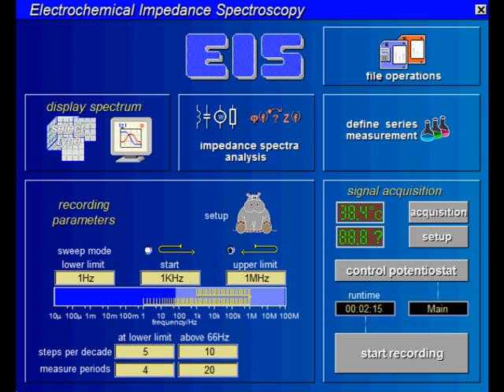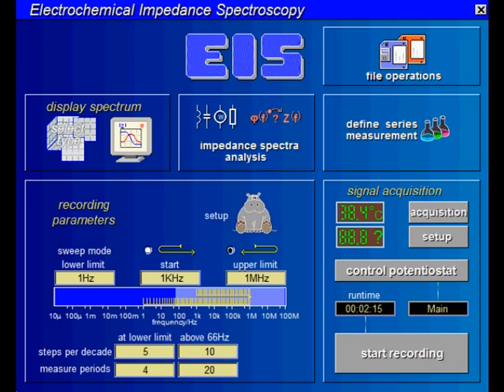Additionally, you can set the starting frequency, which can be any frequency within the range you set before. We recommend keeping the sweep mode as it is. In this case, the frequency sweep starts at the starting frequency, goes up to the upper frequency limit, and then back to the lower frequency limit. The range between the starting frequency and upper frequency is measured twice, allowing you to check the stability of your probe — it is stable over time if the two points of the upwards and downwards sweep at the same frequency are matching.